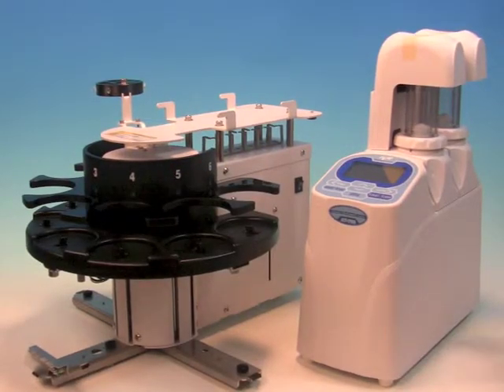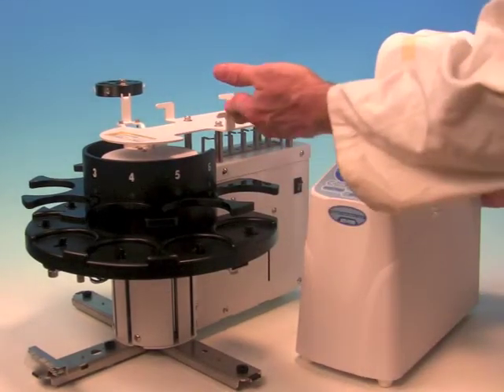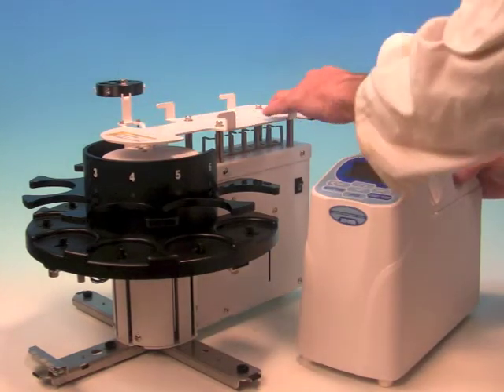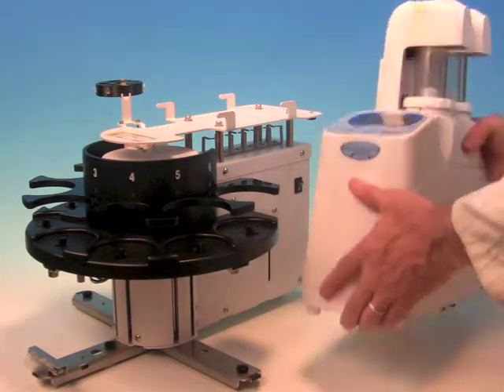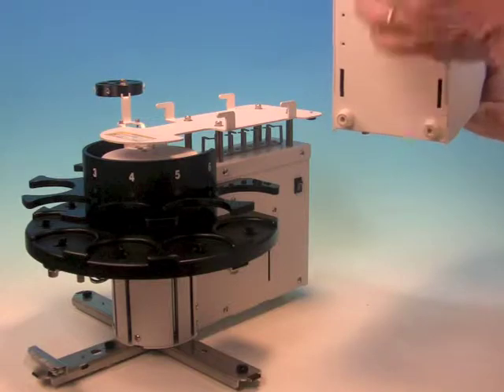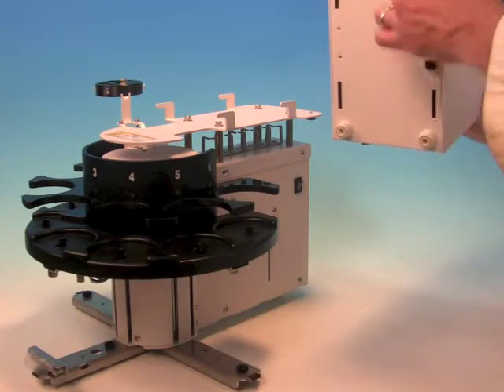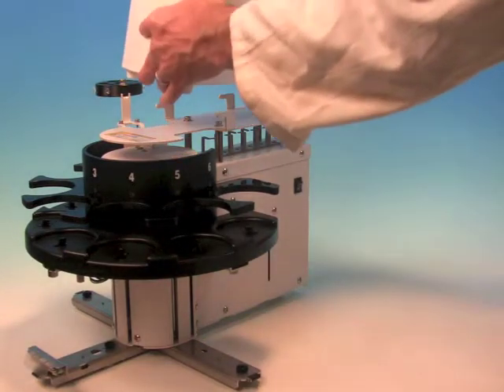This is the AT700 potentiometric titrator shown with the six position mini sample changer. The AT700 can be connected with the sample changer easily by aligning the pegs on top of the sample changer.